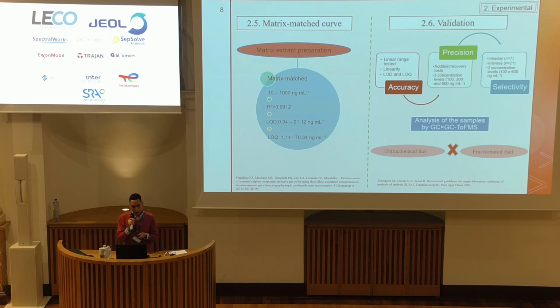Following for the validation, we followed the criteria pre-established by IUPAC, and we evaluated the linearity of the calibration curve that we made, also the accuracy of the method, and for that we applied addition and recovery tests at 3 concentration levels. After that, we did the precision for interday and intraday at 2 different concentrations, and we also evaluated the selectivity of the method. After the optimization and the validation, we could finally analyze the samples by GC×GC-ToFMS, the unfractionated and fractionated fuels.